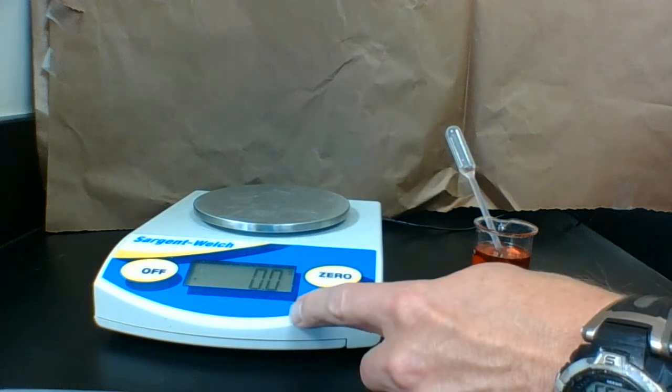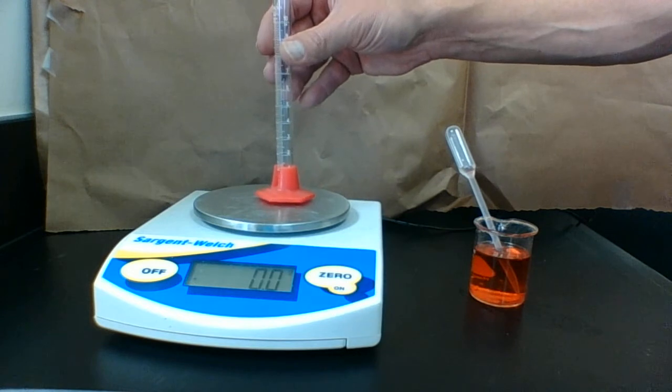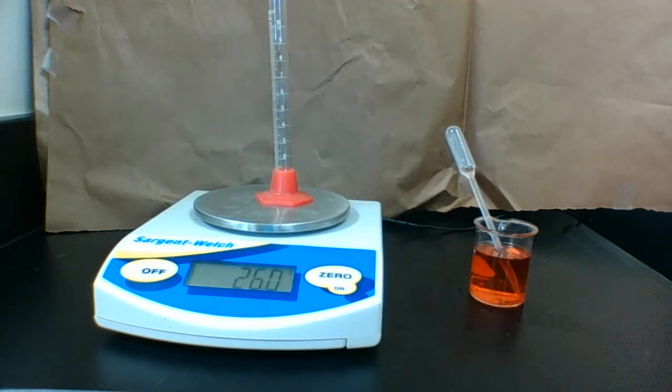I'm going to take a digital scale that's 0.0 grams and I'm going to put a completely empty graduated cylinder on it. That's an important piece of information.